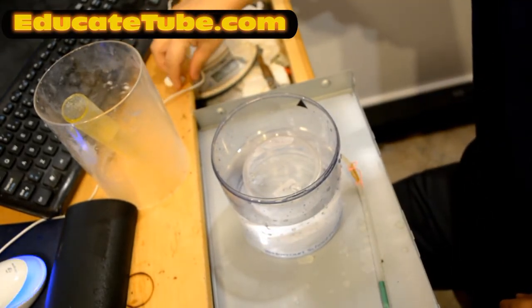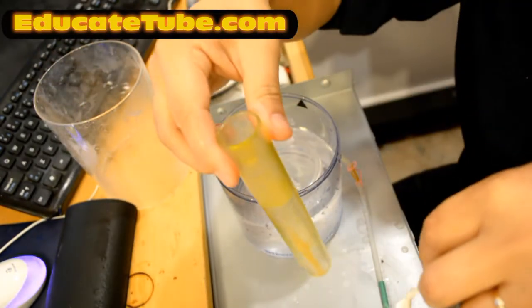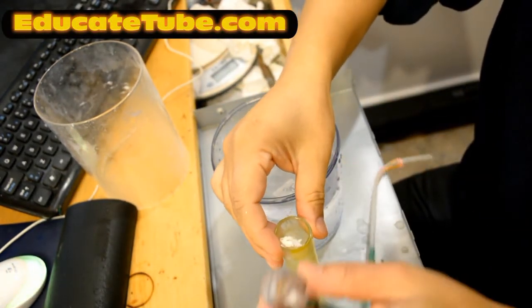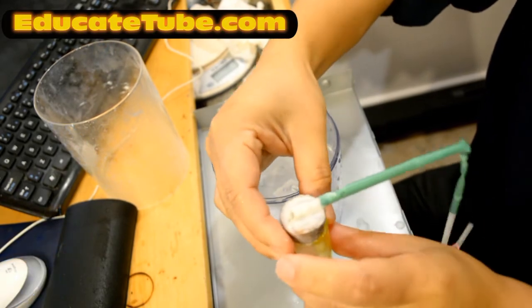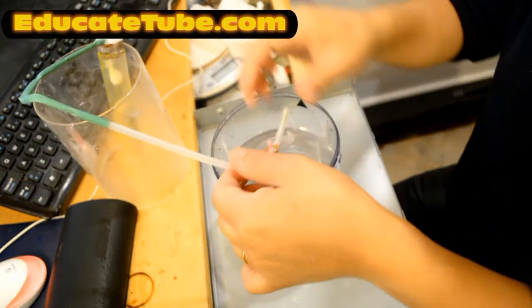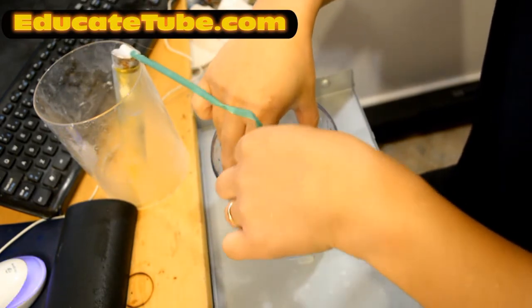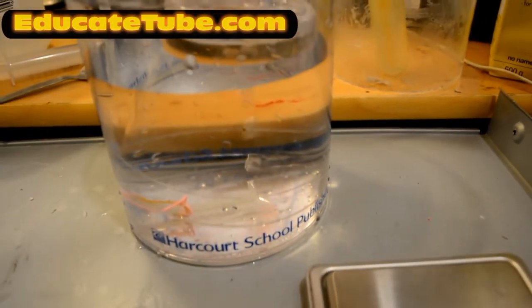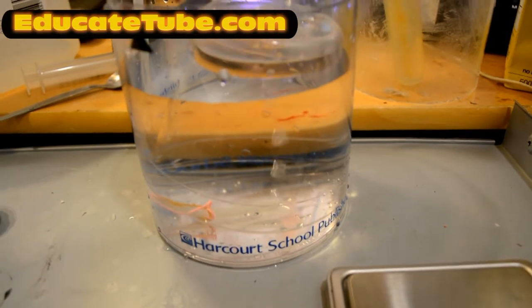So here is the sodium bicarbonate. There is the 5% acetic acid vinegar. I'm going to just put it like this and slowly, okay, don't do it yet, okay, put the tubing in. Okay, as you can see, the bubble is coming. Everything's looking pretty good. This should be the final one that I'm going to be doing in the experiment. So this is the third trial.